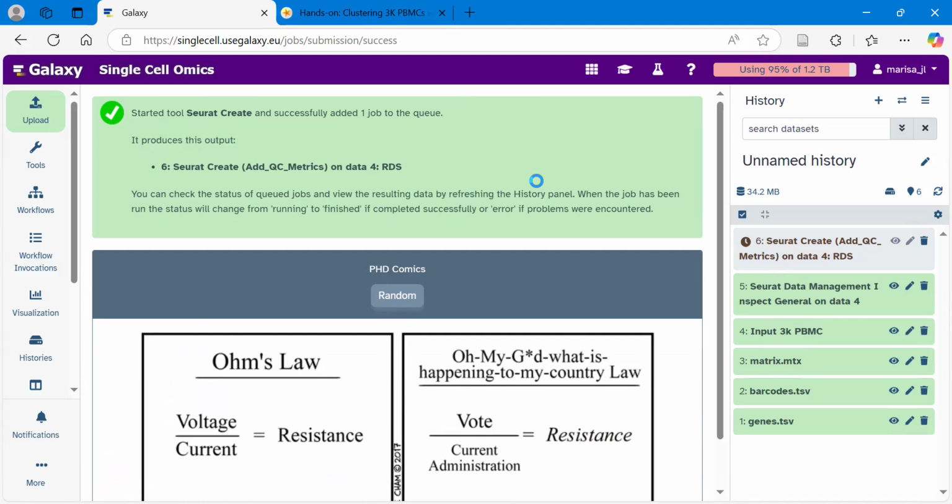And that's something that can tell us whether it's a good quality cell, because generally, if we have a really high proportion of mitochondrial RNAs, that can indicate that there was something wrong with the cell. Maybe it was dying and all its mitochondrial RNAs were being released. Maybe it was broken, so a lot of the nuclear RNAs that were floating around in the cytoplasm leaked out of the cell, so it retained only the mitochondrial RNAs. Those can be signs that we need to filter out those cells from our data set because they're poor quality cells that are not representative of what living or healthy cells should be.